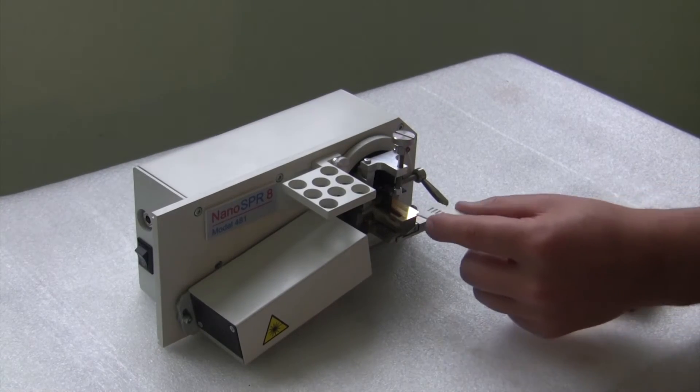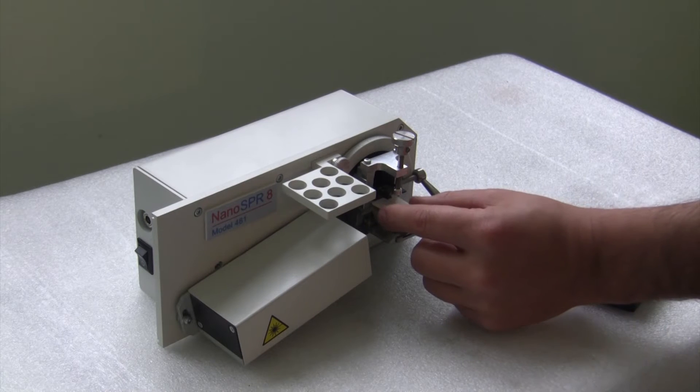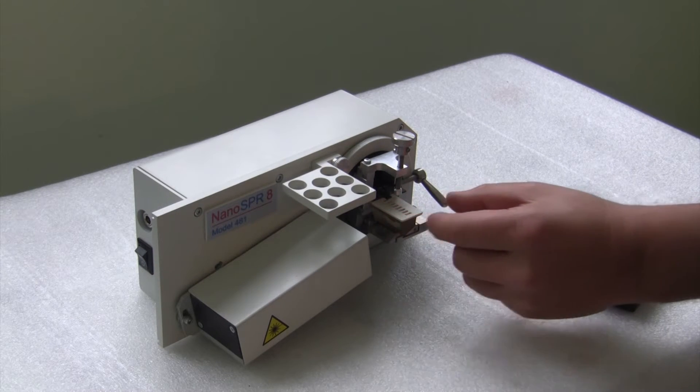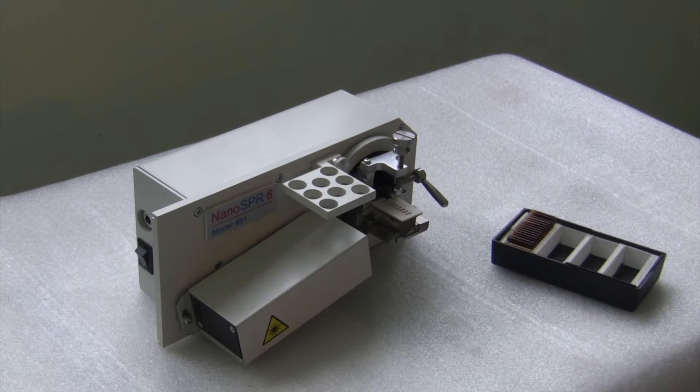Next, we will apply the gasket. Gaskets can vary in thickness. This allows to adjust the volume of the measurement chamber.